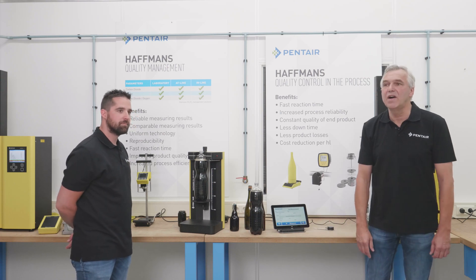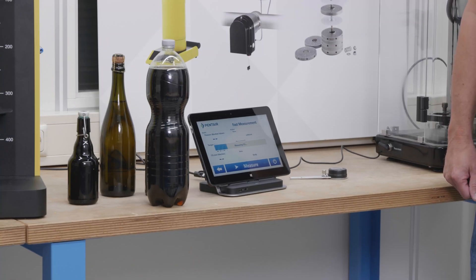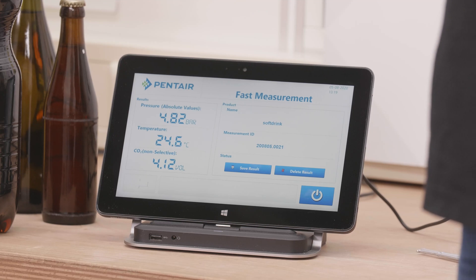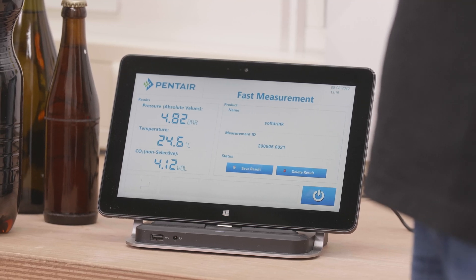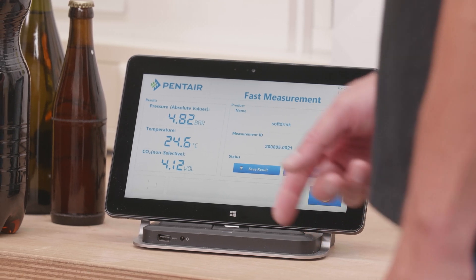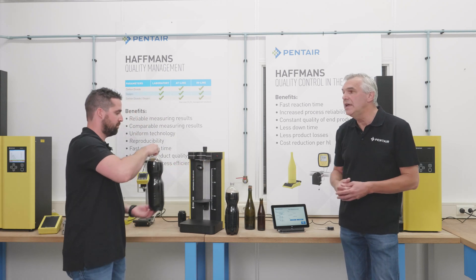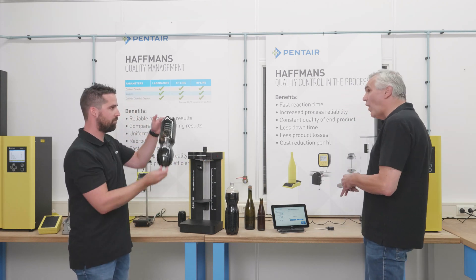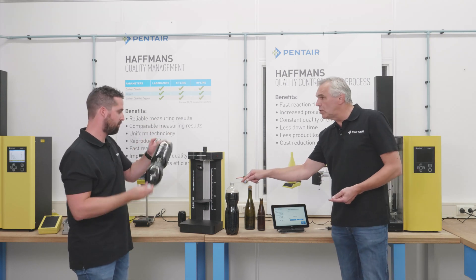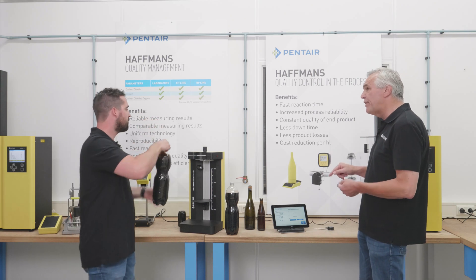This takes approximately 5 to 10 seconds. We see here this has a volume of 4.12. What does that exactly mean? 4.12 volumes means there is a substantial quantity of CO2 in the bottle — 4.12 times the volume of liquid. So in this two-liter bottle, there is more than eight liters of CO2 present.